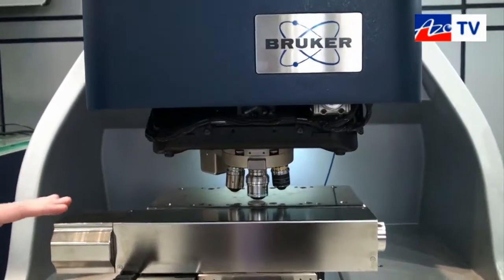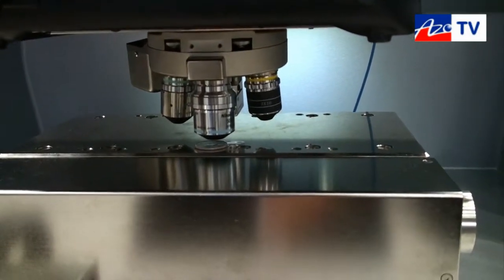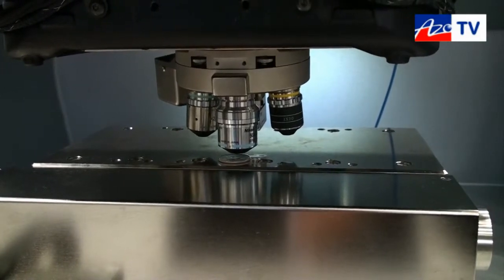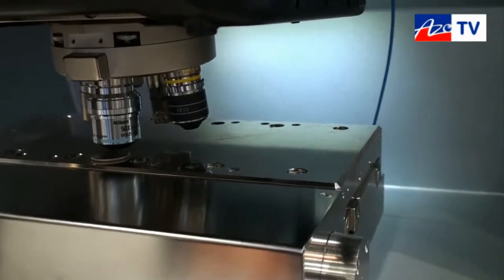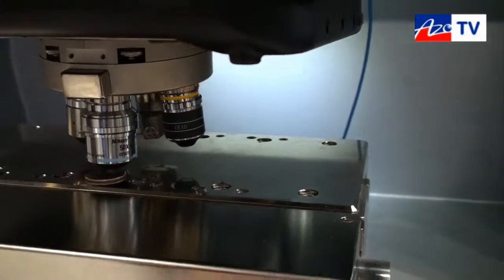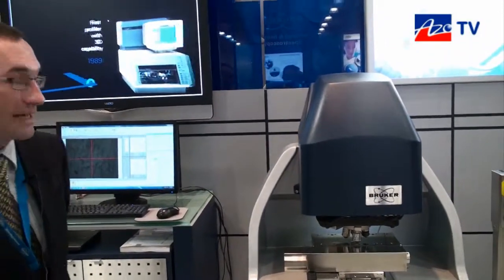This sample is loaded onto a stage that contains encoded motors. The positioning of the stage is controlled through the software and can be automated, allowing us to set up a sequence of automated measurements to collect and analyze data automatically. Using this automated stage, we can construct an image through stitching — taking a series of adjacent images with some area of overlap and assembling them to form a larger field of view, producing an image that's many tens of millimeters.